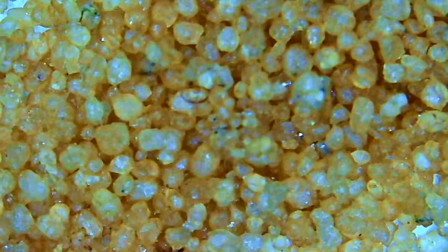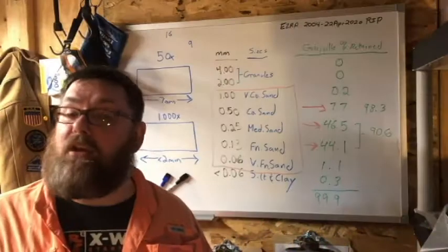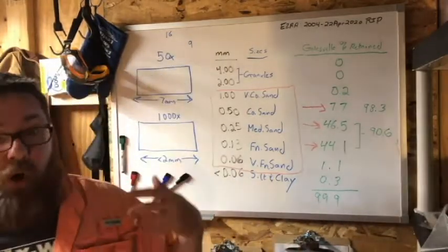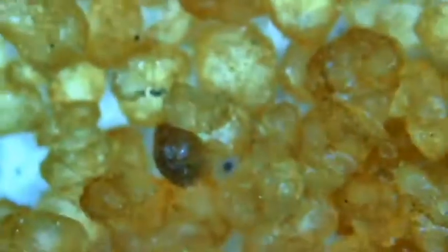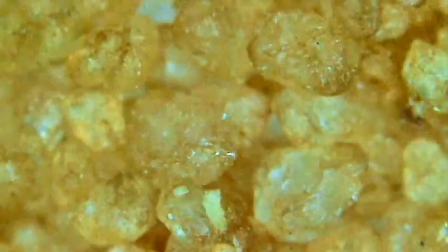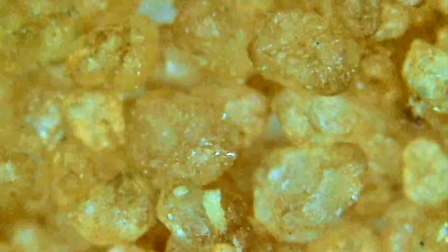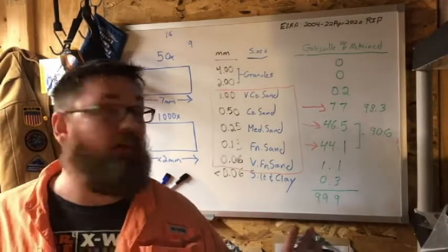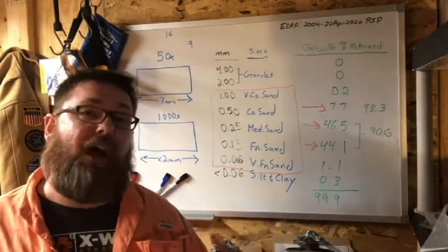This 50x detail for most of my purposes is all I need, unless I'm looking at siltstones or shales. Then I need to go to the thousand times zoom, which is right here. A lot of that orange color disappears. It looks a little ambery, a little yellowy, but some places it's white. The grain sizes are pretty equal, pretty homogenous. There's not a lot of variation. They're pretty much in between that fine to medium part on our graph. This does confirm our sieve analysis. Occasionally you will see a bigger grain larger than half a millimeter, which is the line for coarse sand. So we do have some coarse sand.